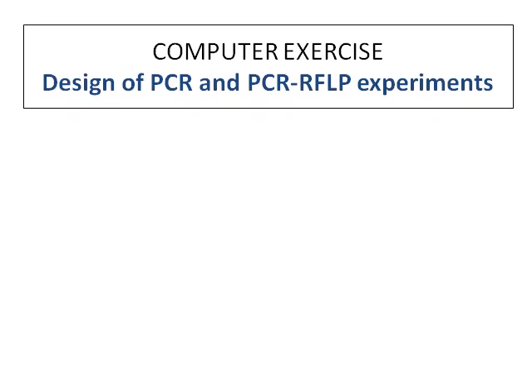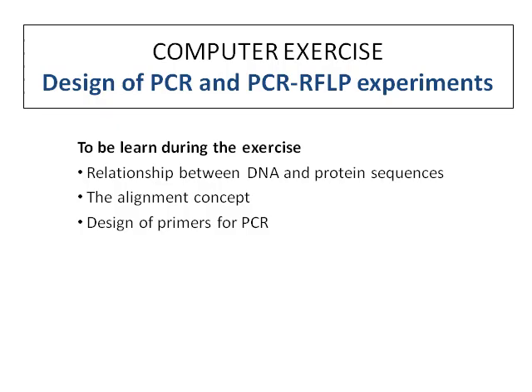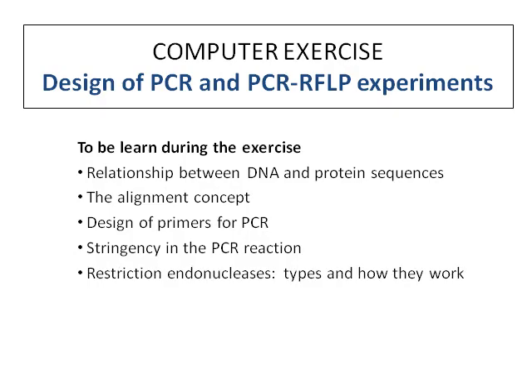The computer exercise may be an easy-to-perform mechanical exercise, or a complete process used to learn many molecular biology concepts, such as the relationship between DNA and protein sequences, the concept of alignment, how primers are designed, what stringency is in a PCR reaction, what restriction endonucleases are, their types, and how they work, and the concepts of typing and clustering. It is the responsibility of the instructor to make this exercise useful for their students.